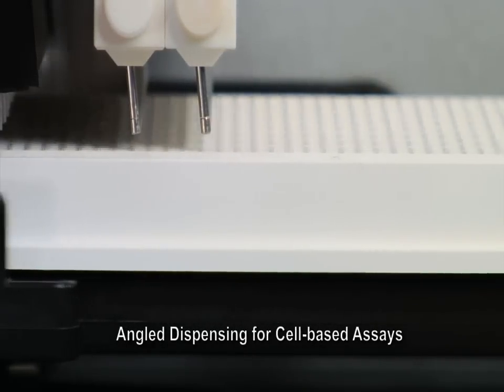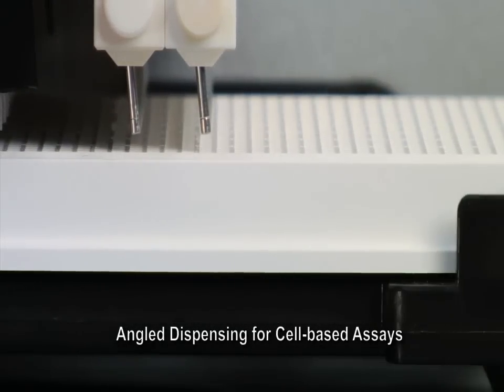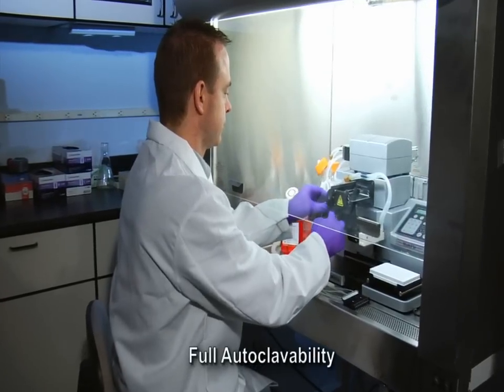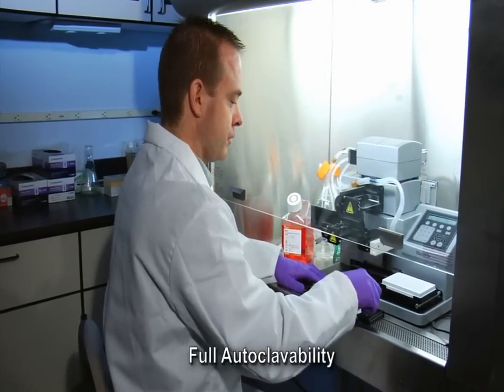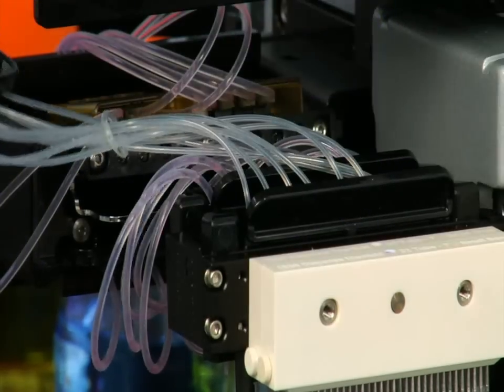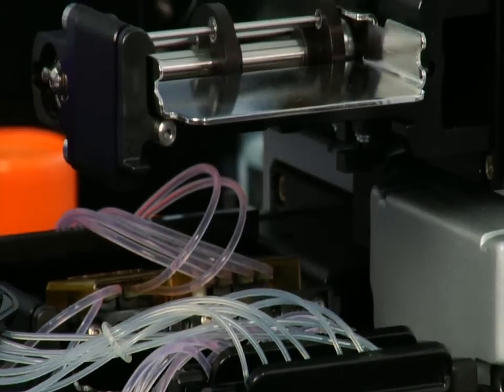Angled tubes offer minimized turbulence within wells, making the Multi-Flow ideal for dispensing media to loosely adherent cell monolayers. All of the Multi-Flow's dispenser fluid paths are fully autoclavable for guaranteed sterility. The Multi-Flow can be equipped for 1 to 4 reagent dispensing in a single instrument.